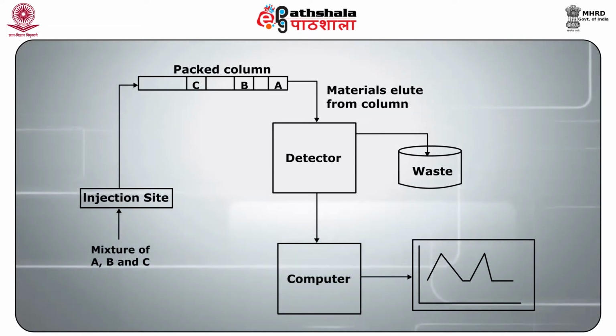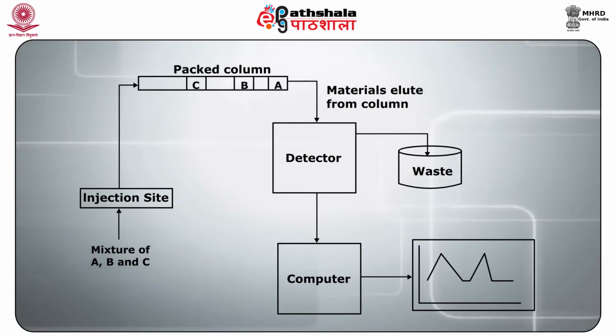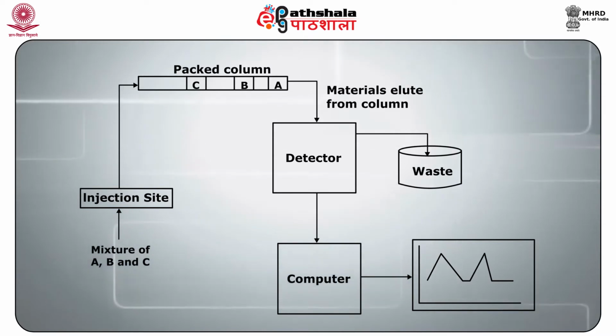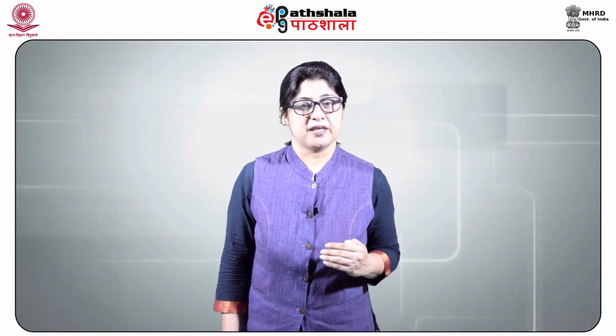The mixture is injected at the injection port. The mobile phase carries it forward through the packed column where it separates into the components. The detector detects the separated analytes and the recorder, usually a computer, records this information. Following are the components of the liquid chromatographic technique.